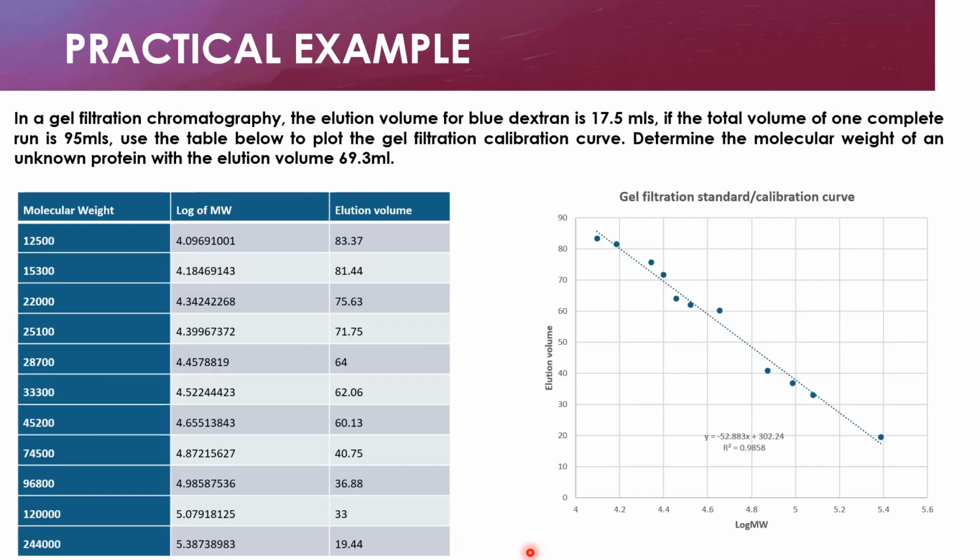And finally, let us also use this calibration curve to determine the molecular weight of our unknown protein with the elution volume 69.3.